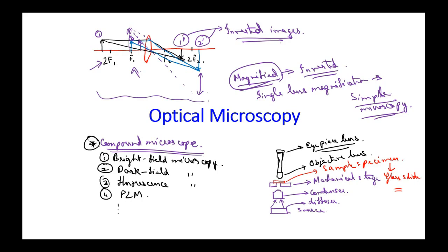Okay, so there are many other microscopic techniques also, some of which we will be discussing. It is not possible to discuss all the things in a very short time. So what we will be doing is taking up some of the microscopic techniques and discussing those.